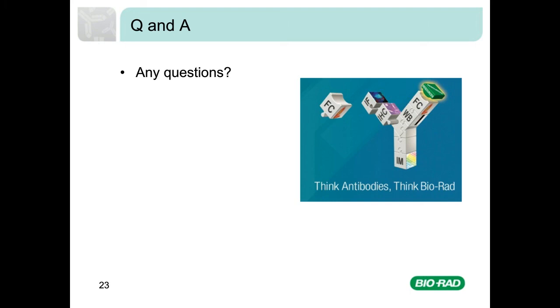If you do need to use fluorophores at shorter wavelengths, such as FITC, you can distinguish true signal from autofluorescence by plotting the data against another compensated shorter wavelength fluorophore, such as PE. Genuine signal will only appear on the FITC axis, whilst autofluorescence will be visible on both fluorophores.